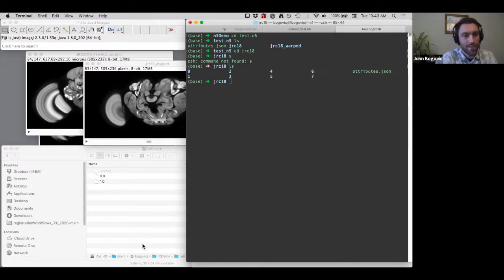And I agree, and I hope that we'll be able to make that work too. Because Mark, with his sharp eyes, noticed that the old HDF5 plugin didn't open the metadata right. Go ahead. Yeah, I'm not aware of the Fiji side, of course, but in principle, what do you see as barriers of mapping this to HDF5? Because it should support all of this in its attributes functionality.